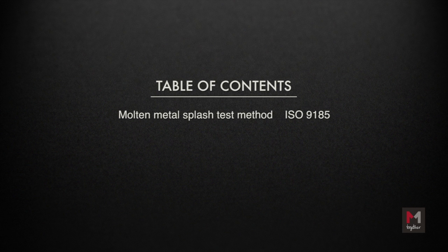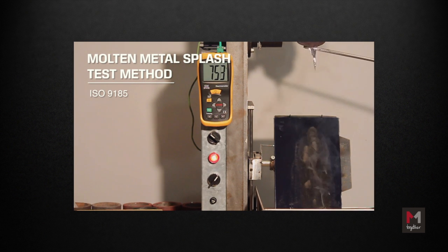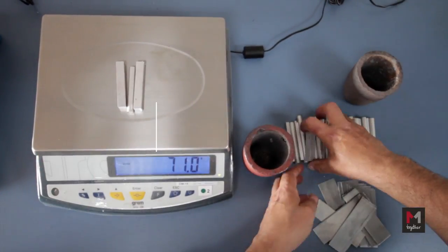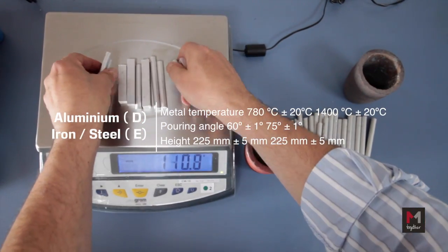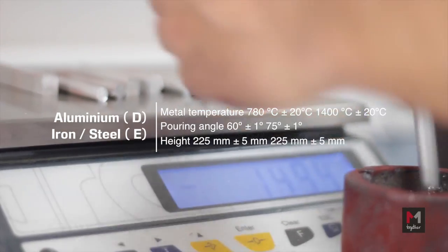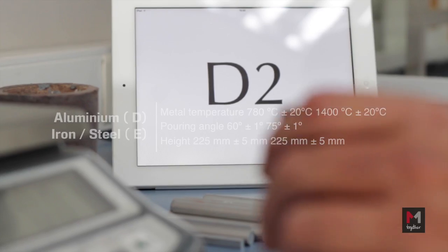The test method described in this video is the Molten Metal Splash Test Method ISO 9185. This test is done under the following conditions: Metal Temperature — Aluminium at 780 degrees Celsius and Iron/Steel at 1400 degrees Celsius. Release Angle is 60 degrees for Aluminium and 75 degrees for Iron/Steel.